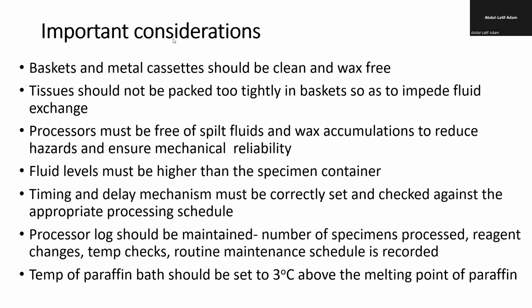The metal or the basket that contains them should be clean all the time, free of wax, especially with the carousel type where it has to be lifted. Sometimes it can be caked, especially if it's not at the molten wax area, and it can prevent movement of the basket. So you have to make sure that you clean it all the time.